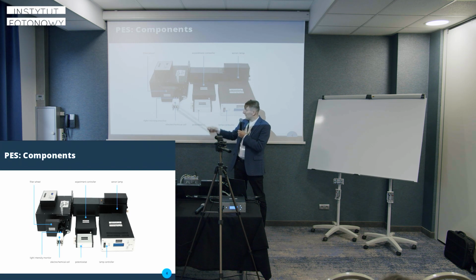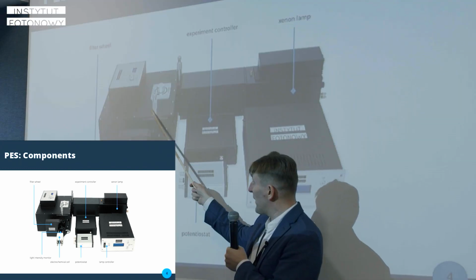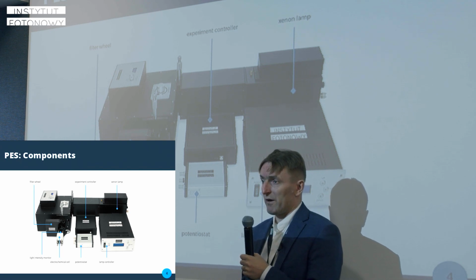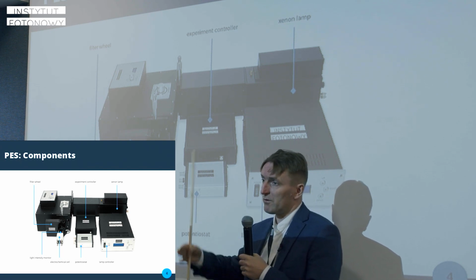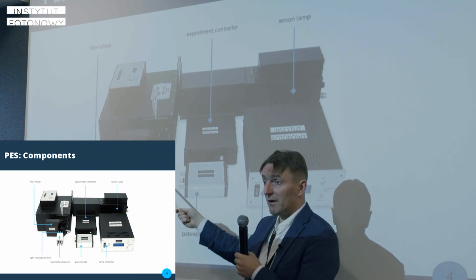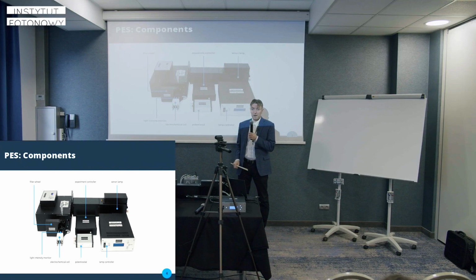And this is a higher order sorting device, because you have wavelengths coming off the monochromator that are multiples of the base wavelengths, and you would like to remove those higher harmonics. This is why the filter wheel comes in handy, because it has filters that remove unnecessary light.